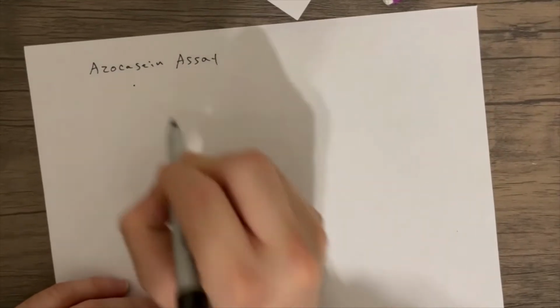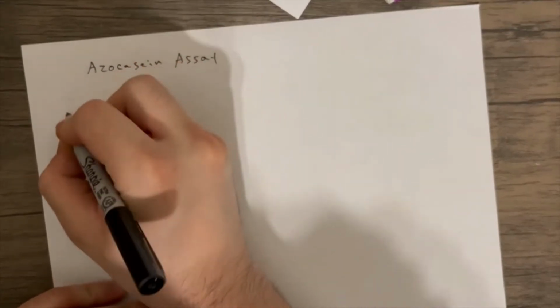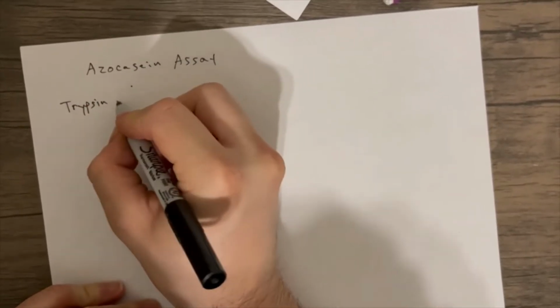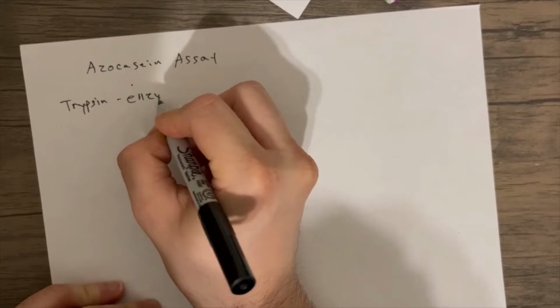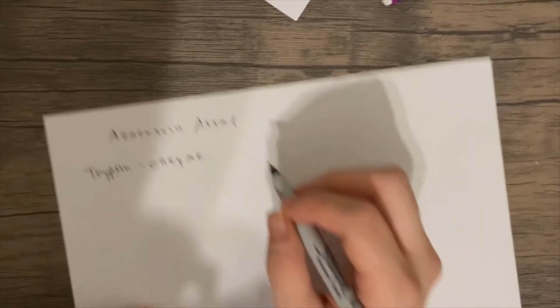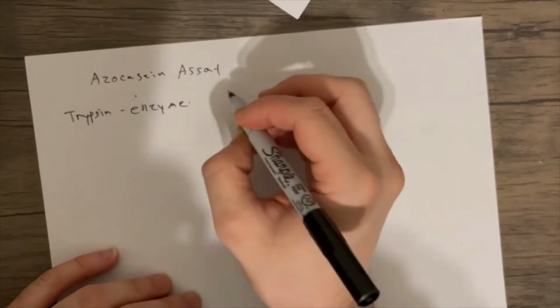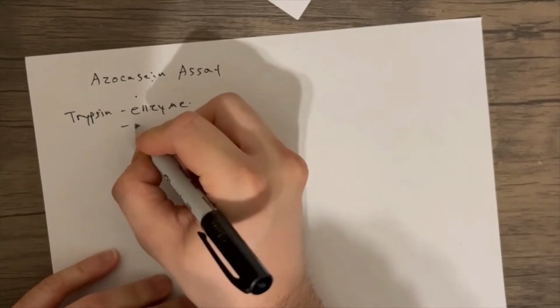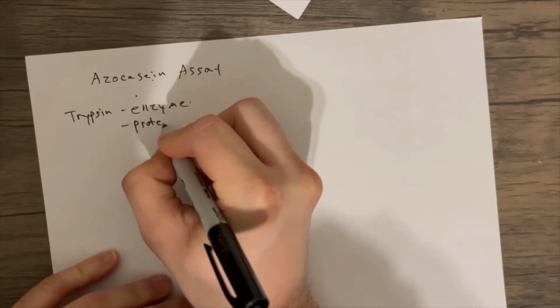to cleave azocasein. So looking at trypsin, we know that trypsin is an enzyme, right? And it will cleave azocasein. So specifically, trypsin is a protease.